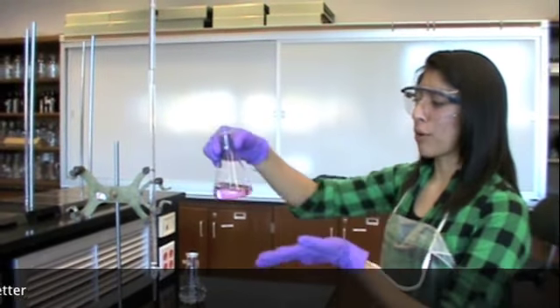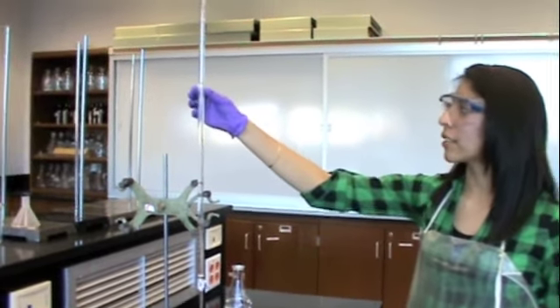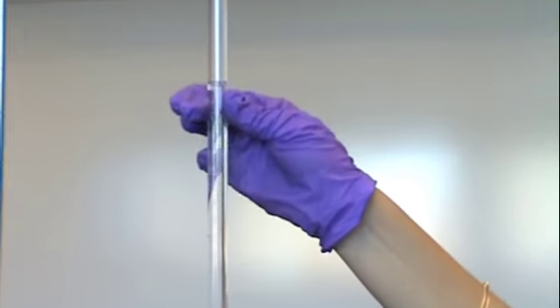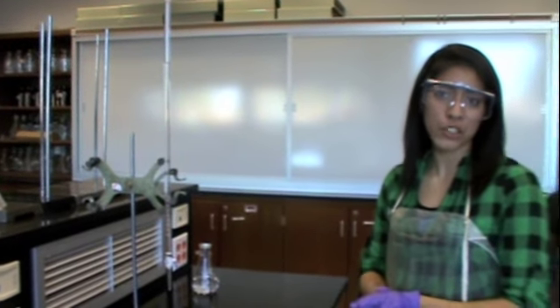Once you have your wonderful titrated solution, make sure that you read the final volume. Now with all this information that you have, you can find the volume of the titrant, which is the final volume minus the initial volume.